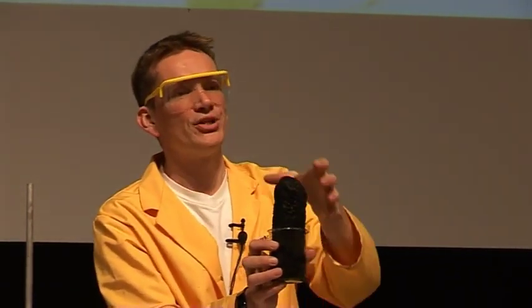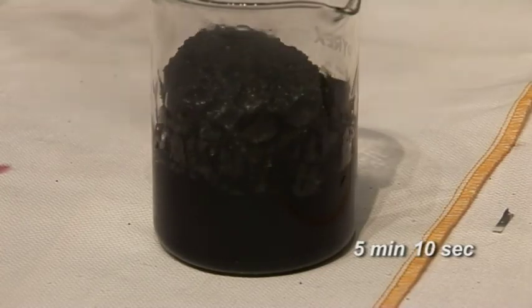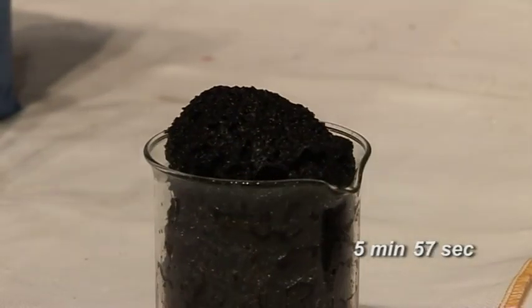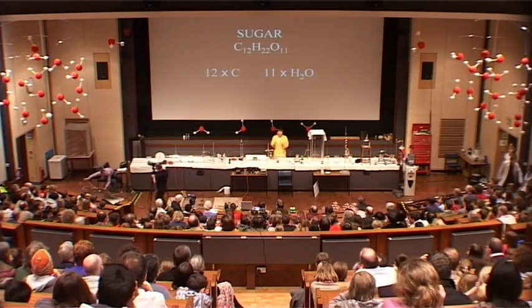And eventually this will go black and form this. Okay, so this is one that we did earlier, right? And the black mass that we see here is actually the carbon that's contained in the sugar. Okay, so we've extracted all of the water. Okay, so far then we've seen examples where we can take water out of things.